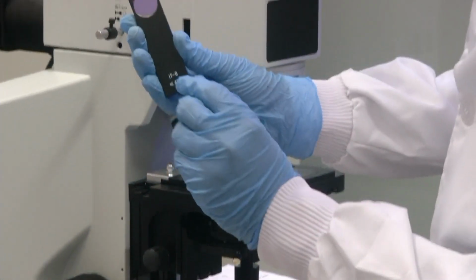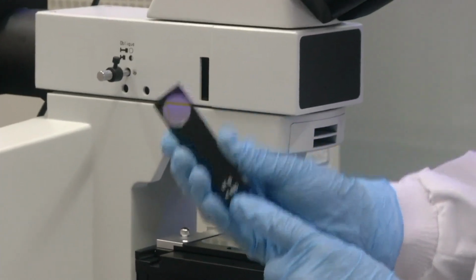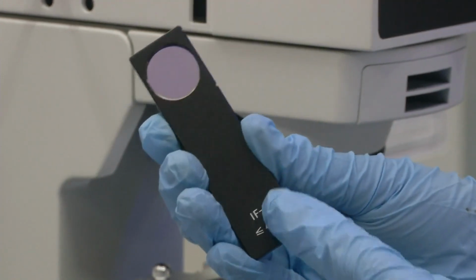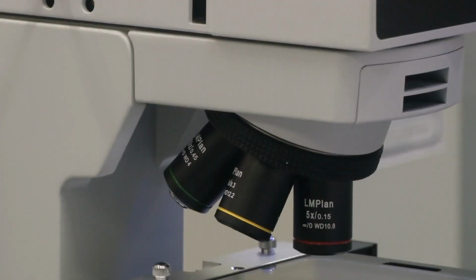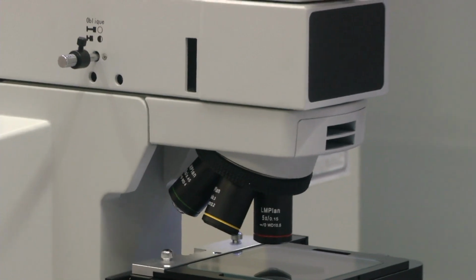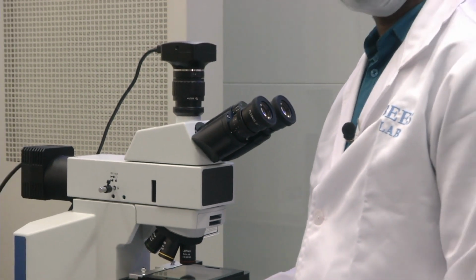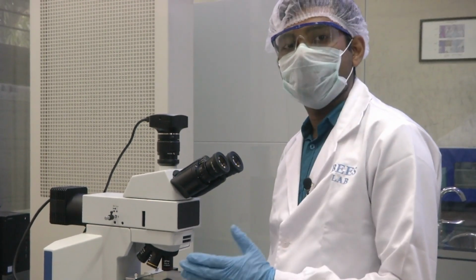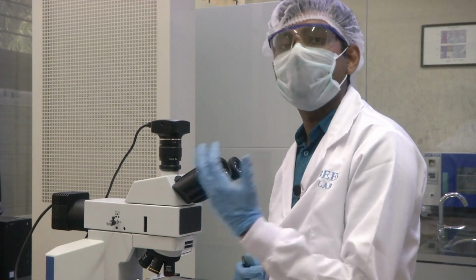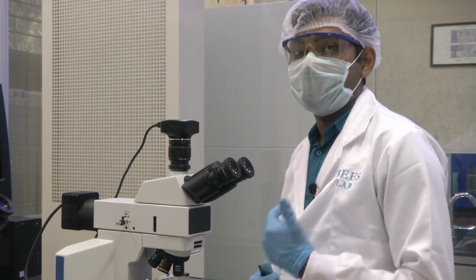If you can see, it is written IFB less than or equal to 480 nanometer. This is the wavelength of the light. So it is telling you that it will pass anything below 480 nanometer, and that is blue light filter. So as you know, if you are aware of optical microscopy and energy relations, blue light has more energy than yellow light. Yellow light goes closer to the infrared spectrum. Blue light goes close to the ultraviolet spectrum, and blue light has lower wavelength. Yellow light has higher wavelength.